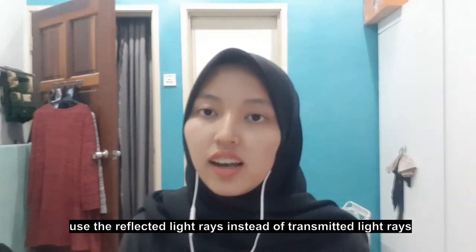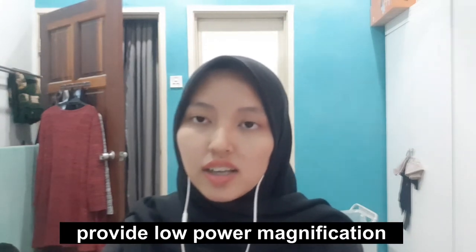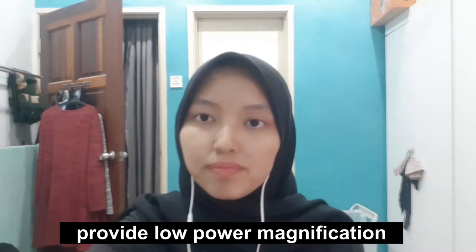Stereo microscope, also known as dissecting microscope, is an optical microscope that is designed for low magnification observation of a specimen. It uses the reflected light rays from the specimen surface instead of transmitted light rays. It provides low power magnification as compared to a compound microscope. The magnification power of a stereo microscope ranges from 5 to 80. It produces a three-dimensional image of the specimen rather than a flat image.